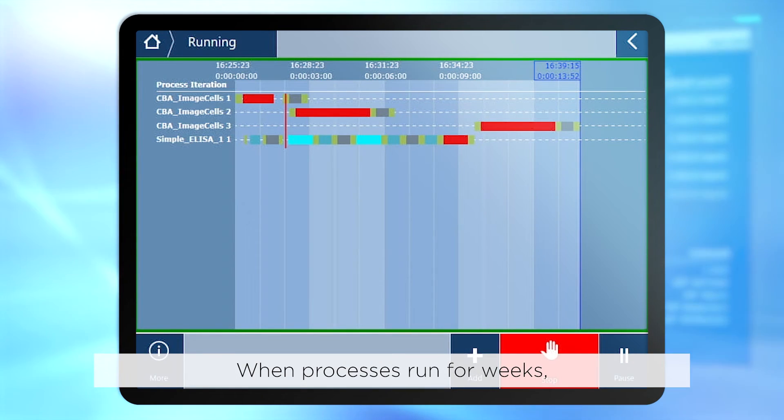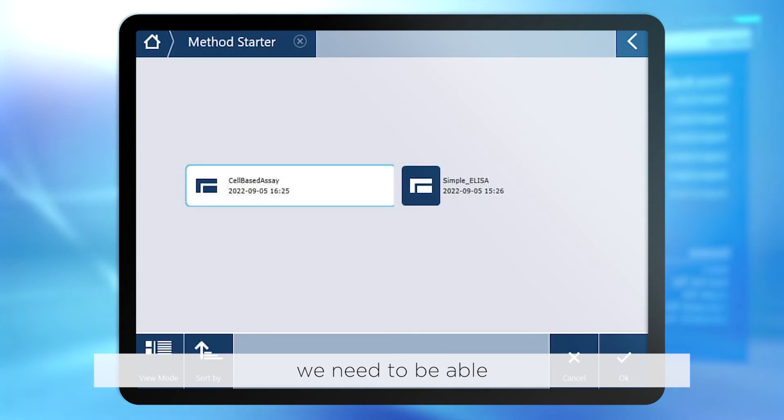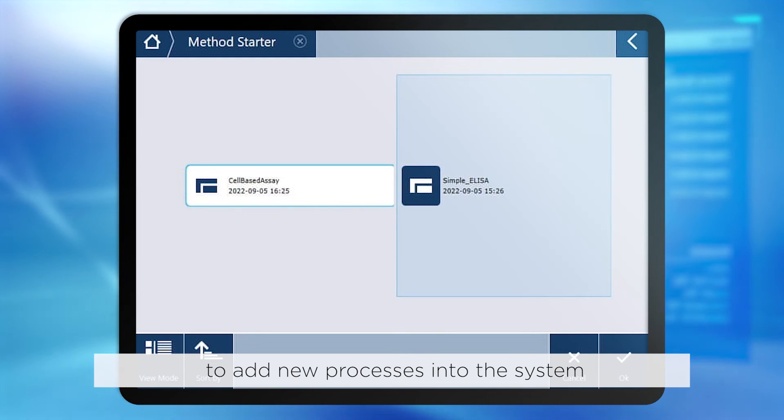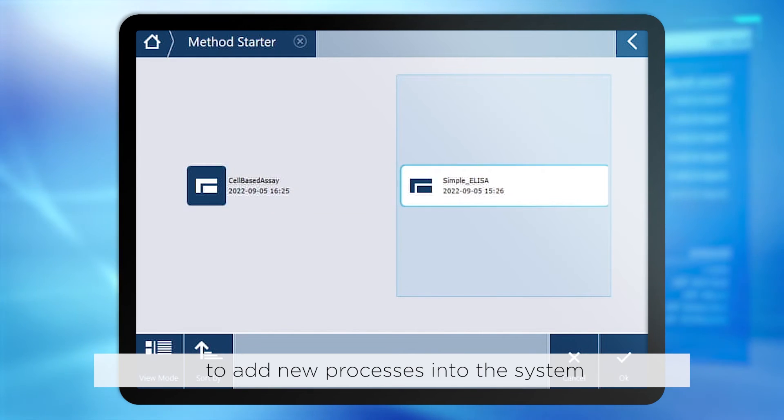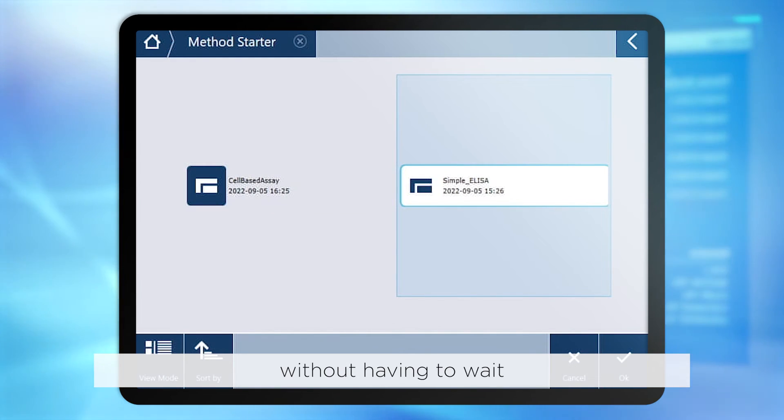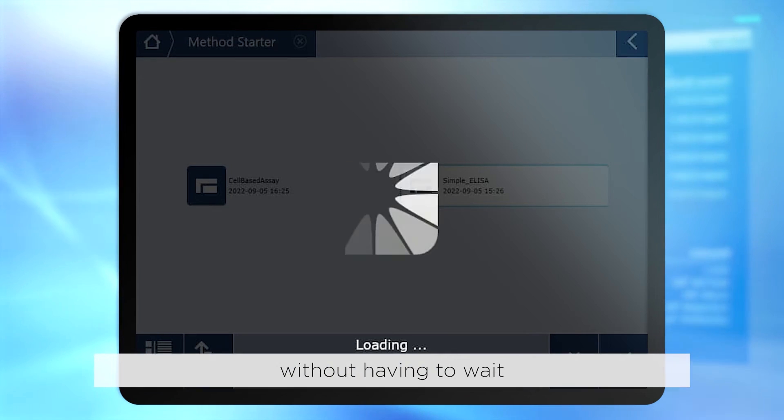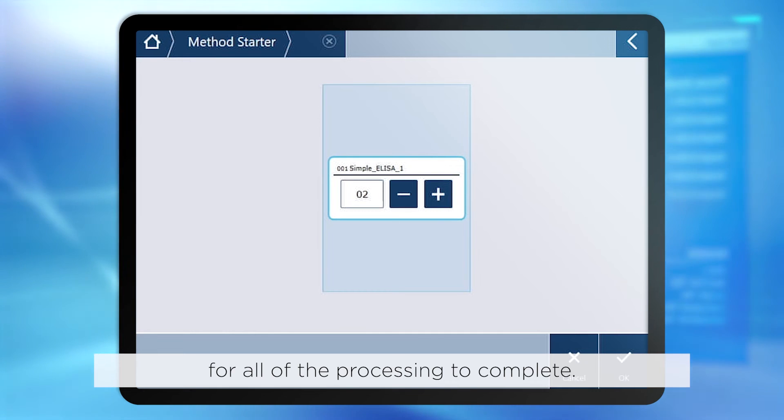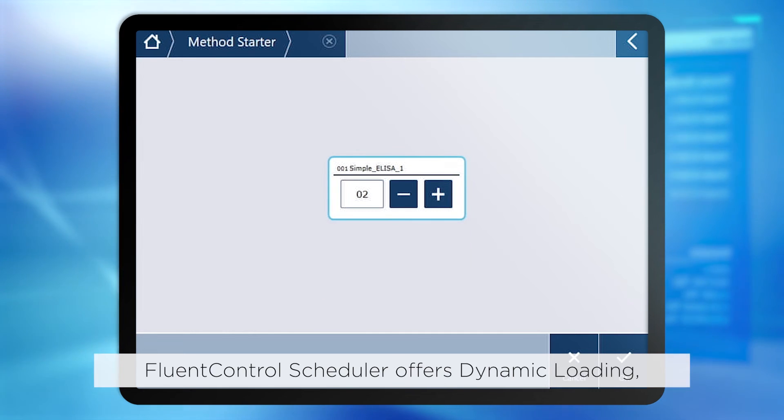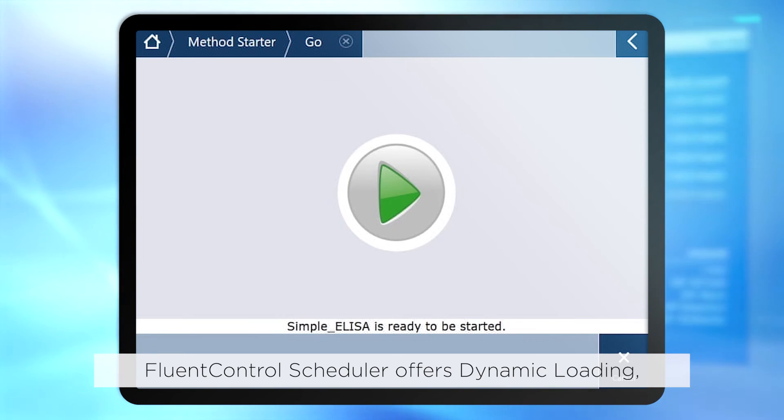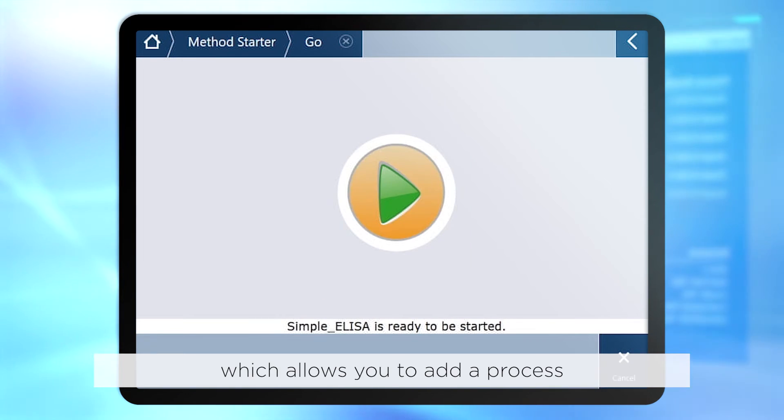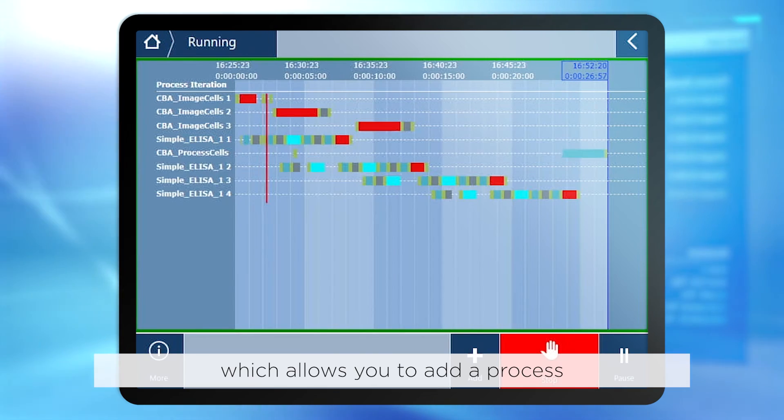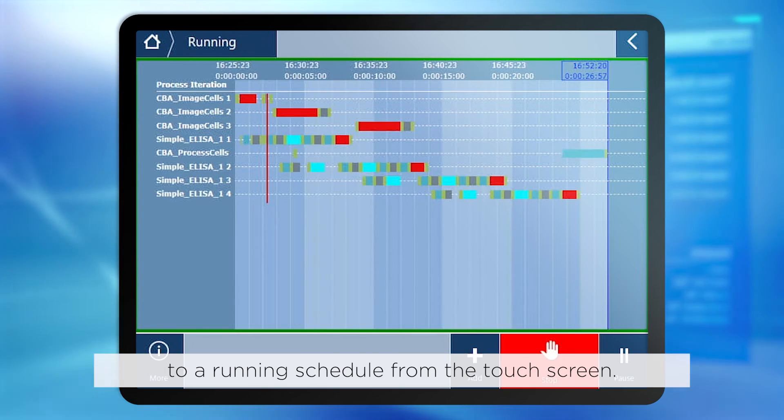When processes run for weeks, we need to be able to add new processes into the system without having to wait for all of the processing to complete. FluentControl scheduler offers dynamic loading, which allows you to add a process to a running schedule from the touchscreen.